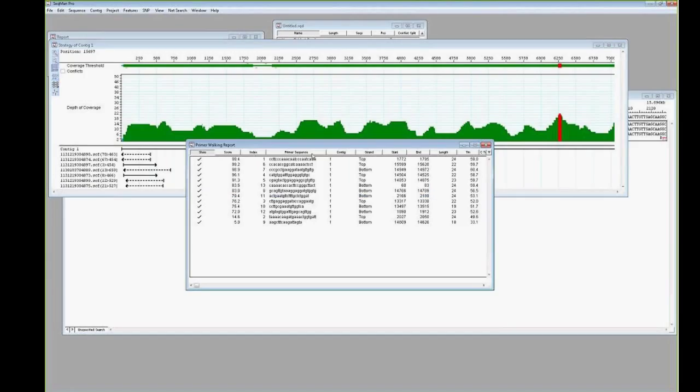And then you can export this primer catalog, as I mentioned, if you want to actually use those sequencing primers for downstream projects to fill in with more sequencing data. And then you could add that data back into SeqMan Pro for reassembly. So that's a short de novo project.